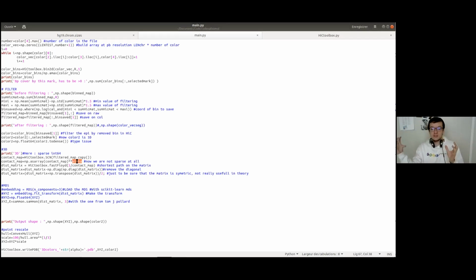So your Hi-C matrix does not reflect one cell, or exactly a cell type. It reflects the mean contact of all the cells that you have sequenced. We hope that they are homogeneous and at the same stage, but sometimes there may be different conformations of your DNA. And so in order to not take all of this information, which can create conflicts, we have to modulate it in order to make something that will be pretty. That's why this alpha parameter exists.